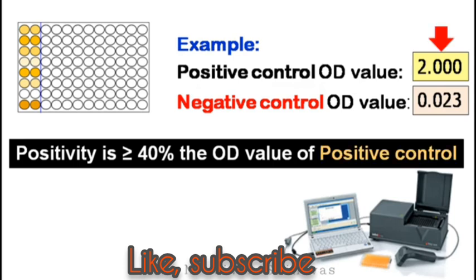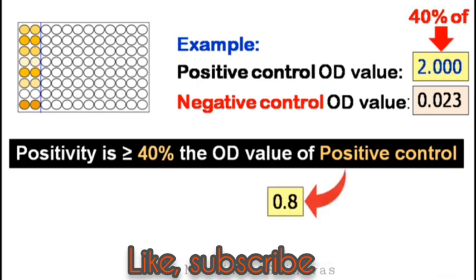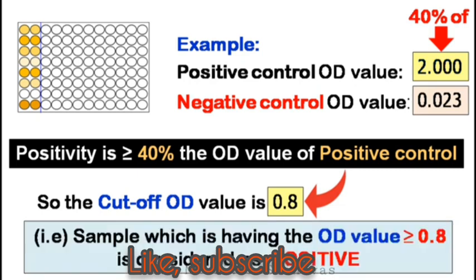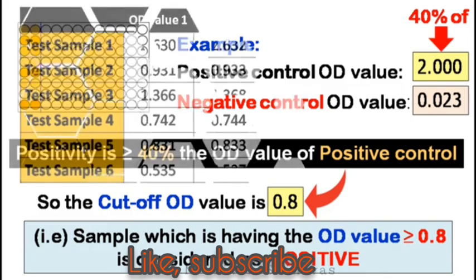That is, here, the positive control OD value is 2.000. Then 40% of 2.000 is 0.8. So, the cutoff OD value is 0.8. Which means, the samples which are having the OD value more than or equal to 0.8 are considered positive.